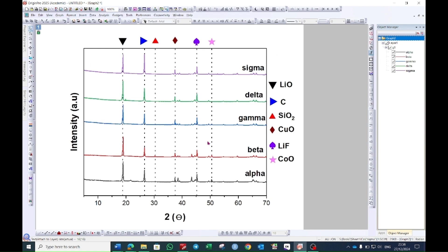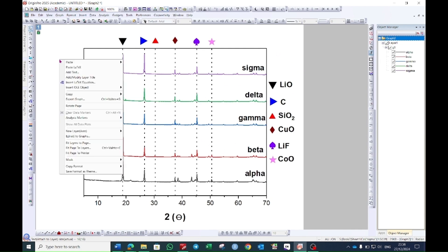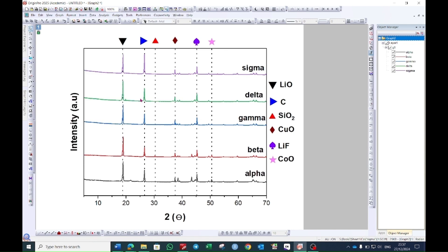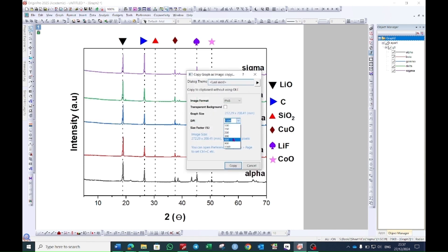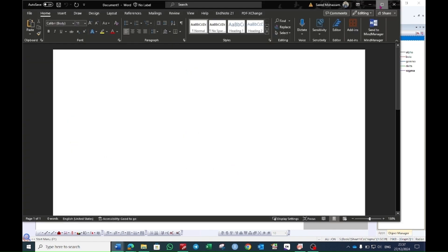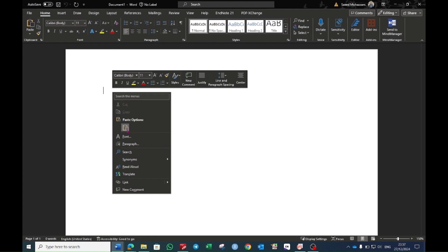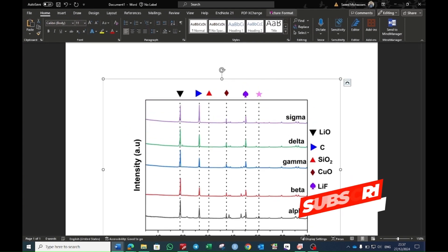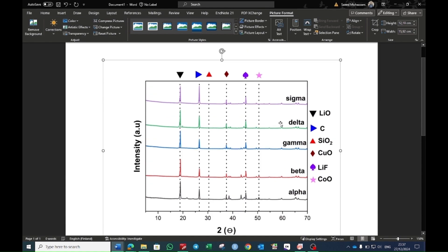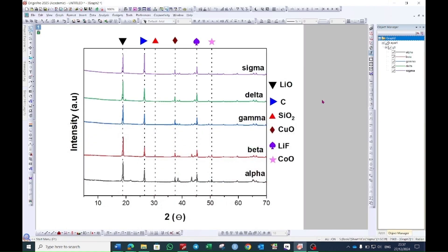Now select the legend and press the Delete button — it will be removed. In this way your graph will be generated. Right-click on the graph and you will see the option 'Copy' — select 'Copy Graph as Image.' A window will pop up; choose the resolution as 600, which is a good resolution, and then press Copy. Open the Word file, right-click, and paste it here. In this way your graph will be transported to the Word file. I hope you like this video.